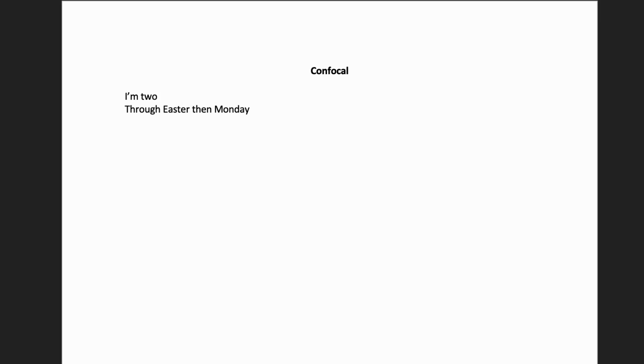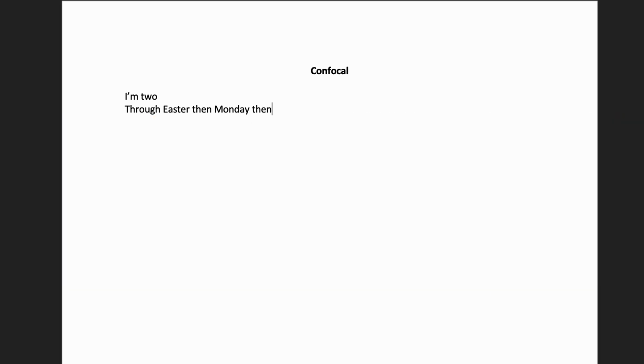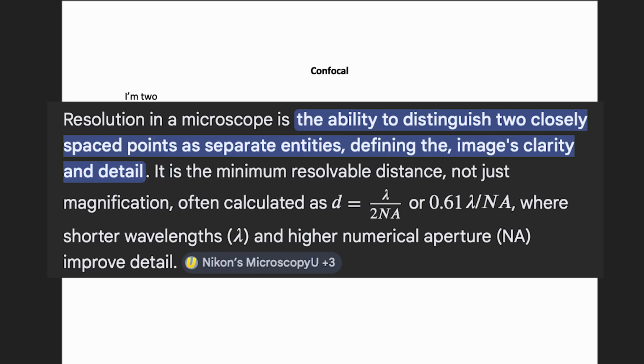This also means that when you take your image with widefield microscopy, your image will be brighter but blurrier, aka you will have less resolution. For those of you who don't know what resolution is, it's your ability to distinguish two things from each other.